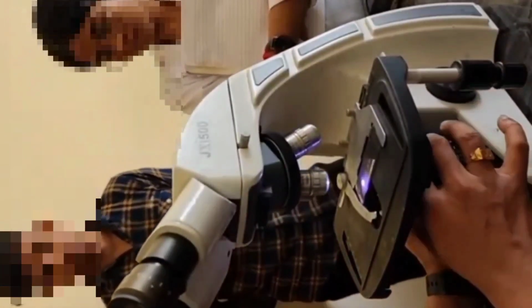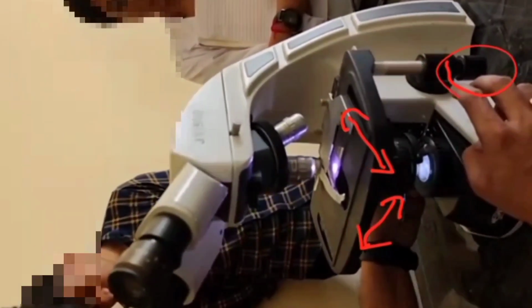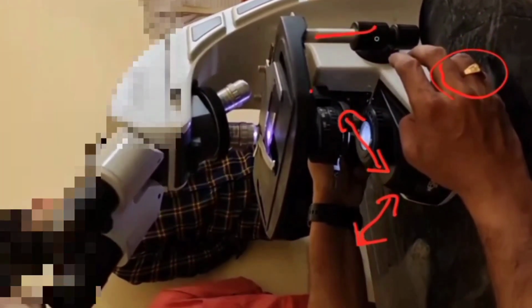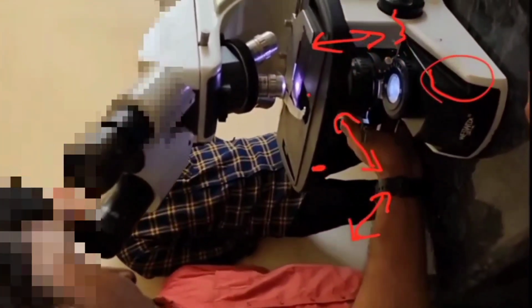You can move your slide in this direction or this direction with the help of this. So any direction you can move. And the stage, you can move up or down with the coarse adjustment. This side we have the coarse adjustment, and this is the fine adjustment.